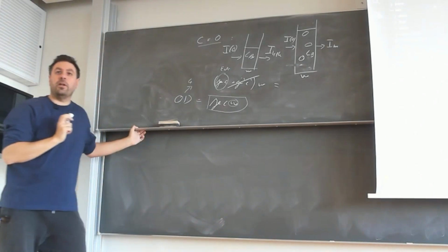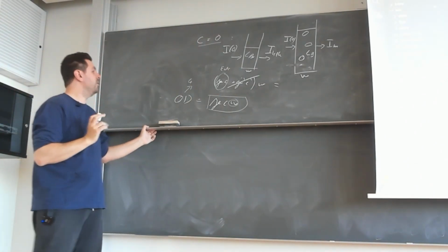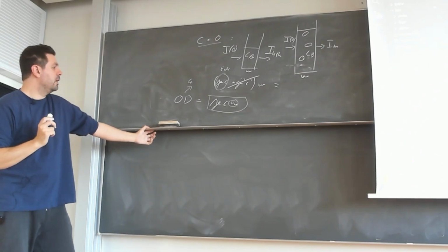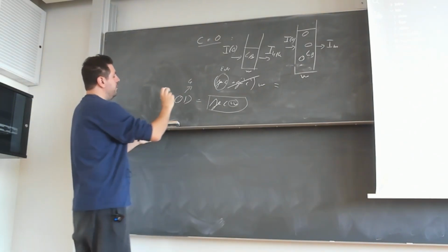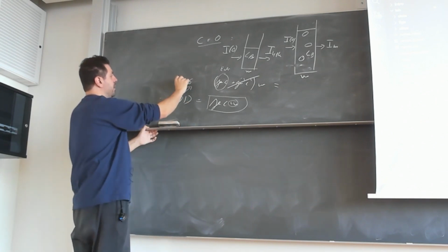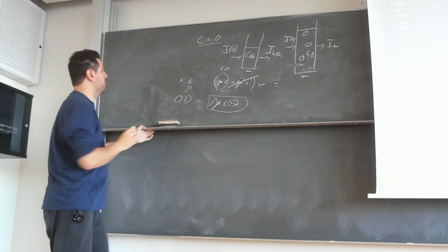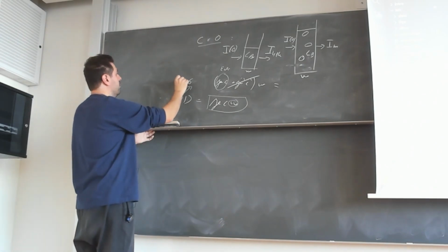That is when they max out. This depends on your device, of course, but let's say our device maxes out at 4. So let's assume the real OD would be something like 6, but we just display the maximum. I cannot measure this. It's above 4.